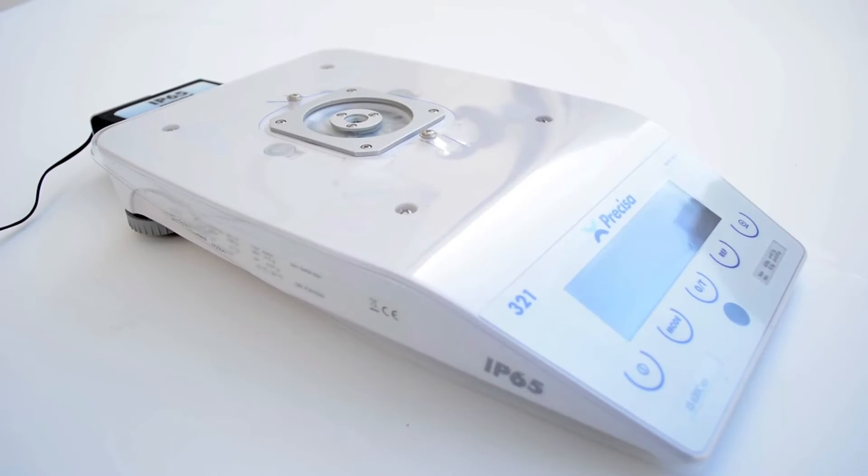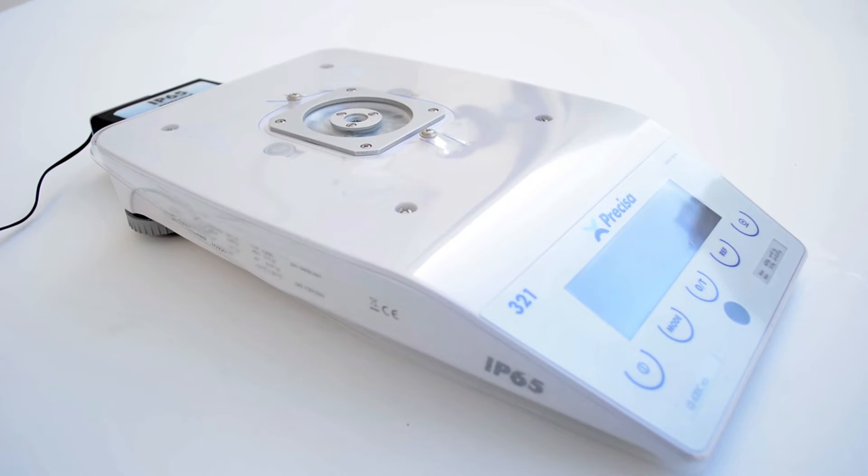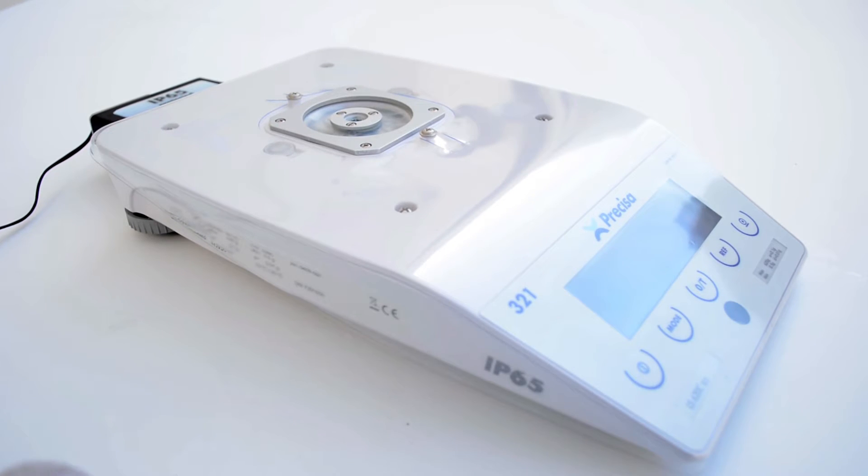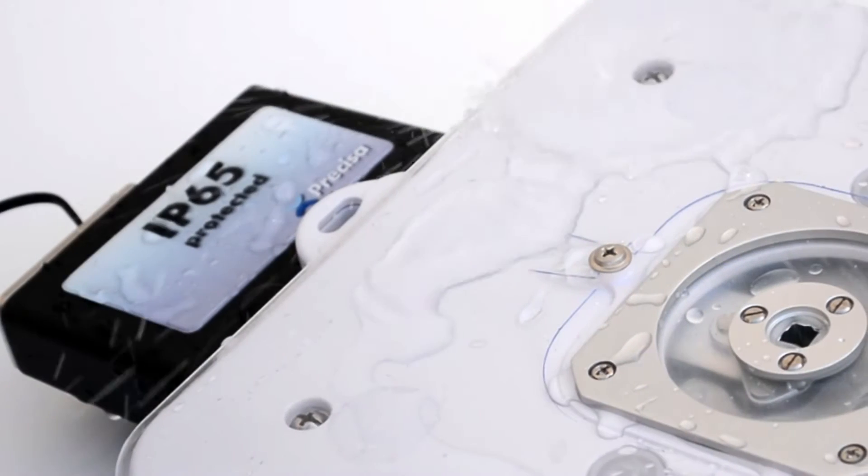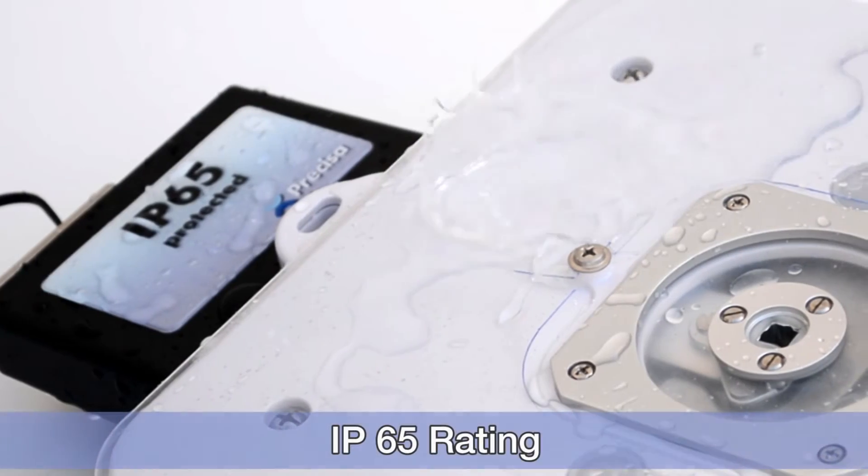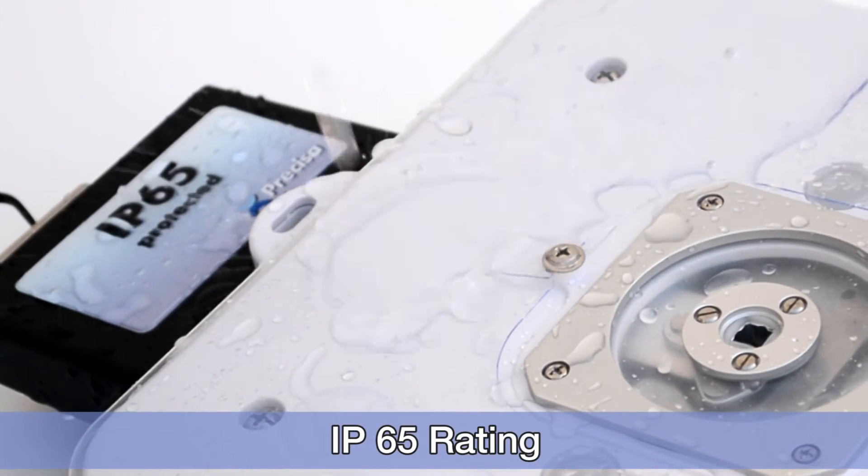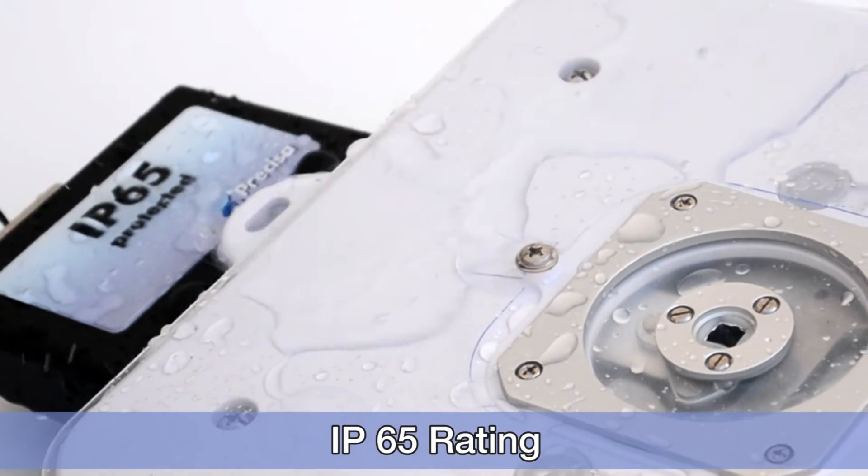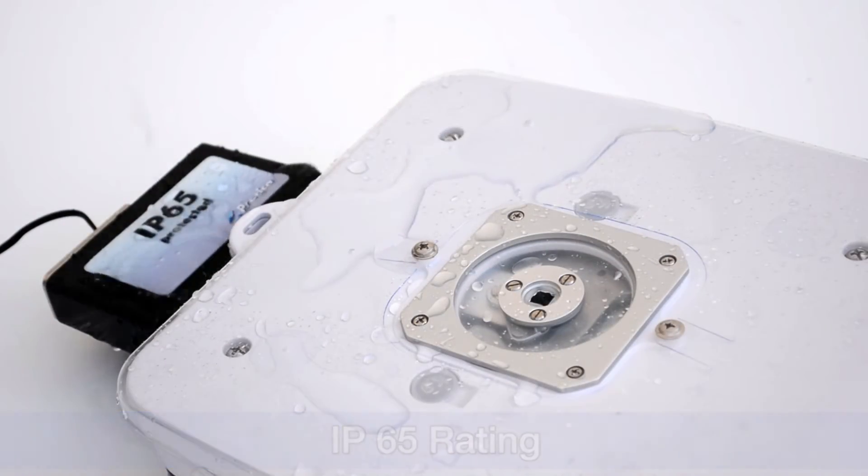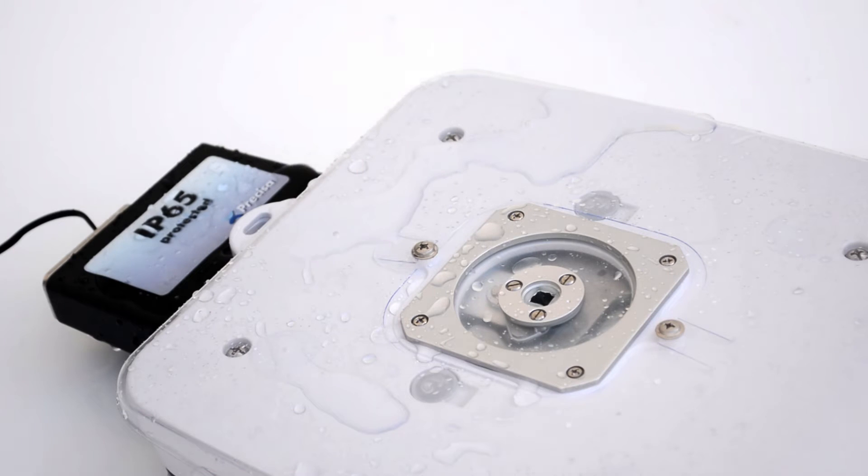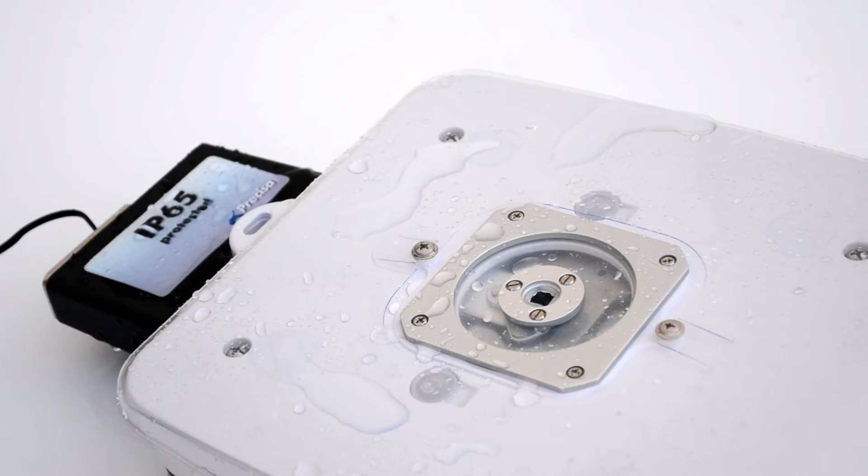For protection from water splash and harmful dusts, select Precisa balances can be optionally provided with IP65 rating. The balance is built from the ground up with IP65 in mind, both internally and externally.